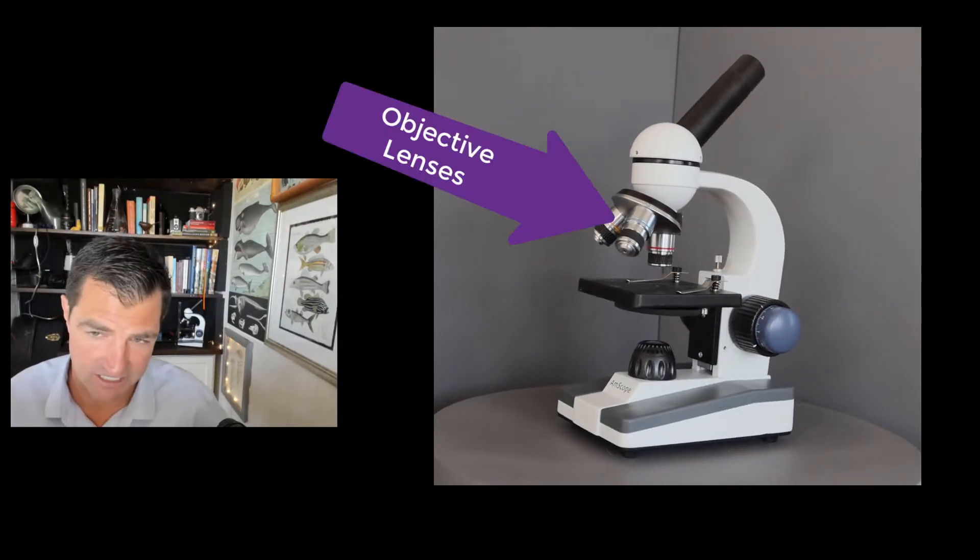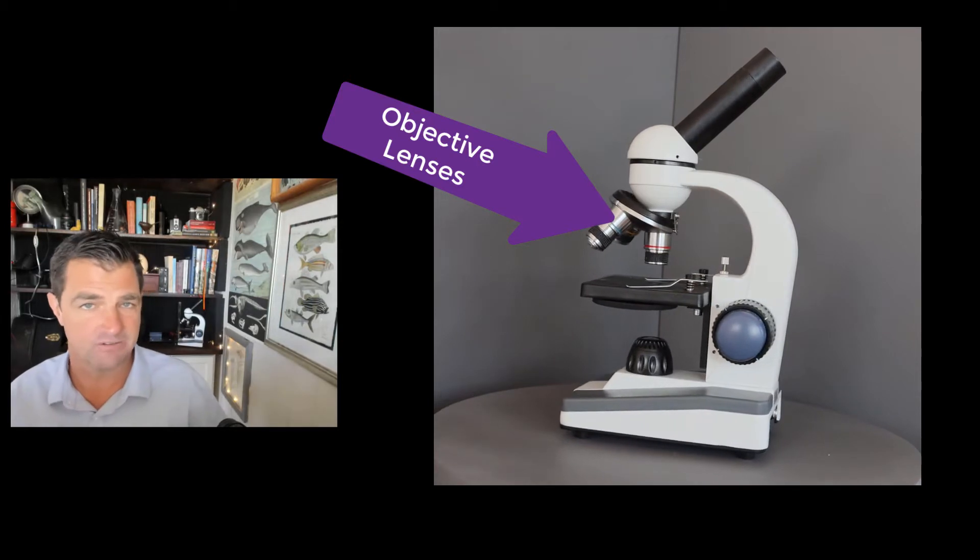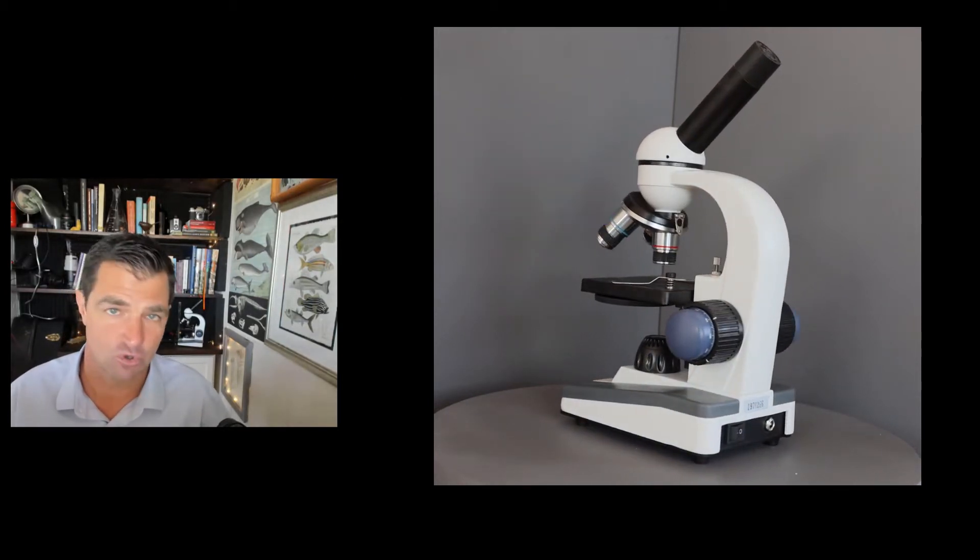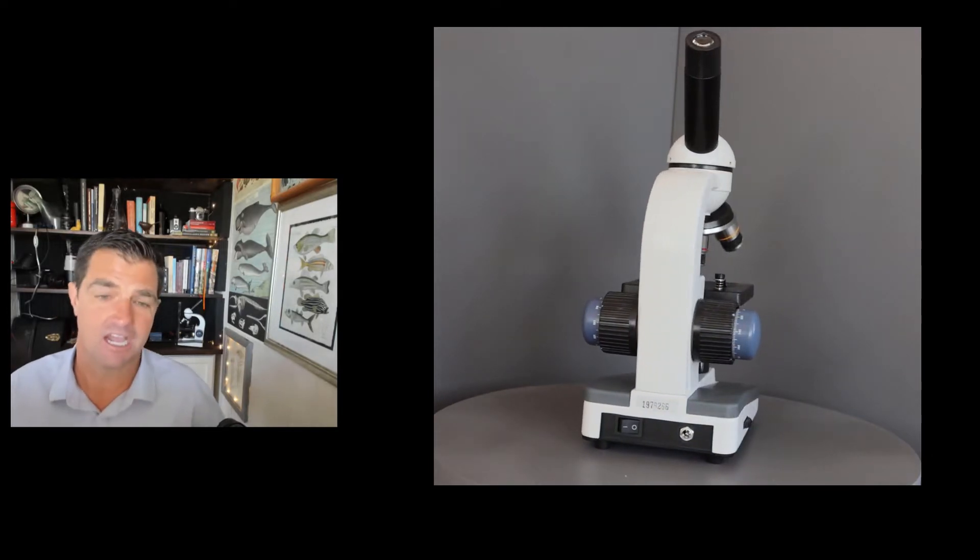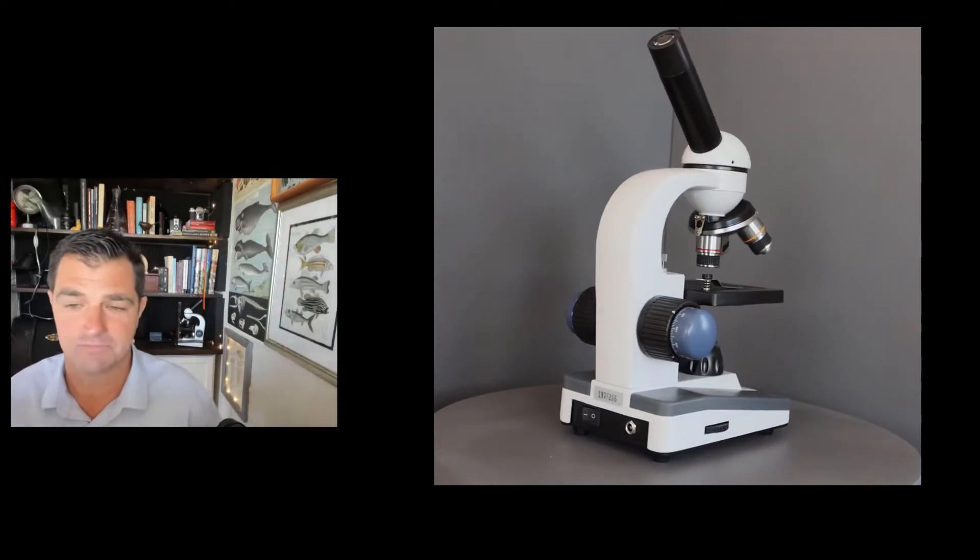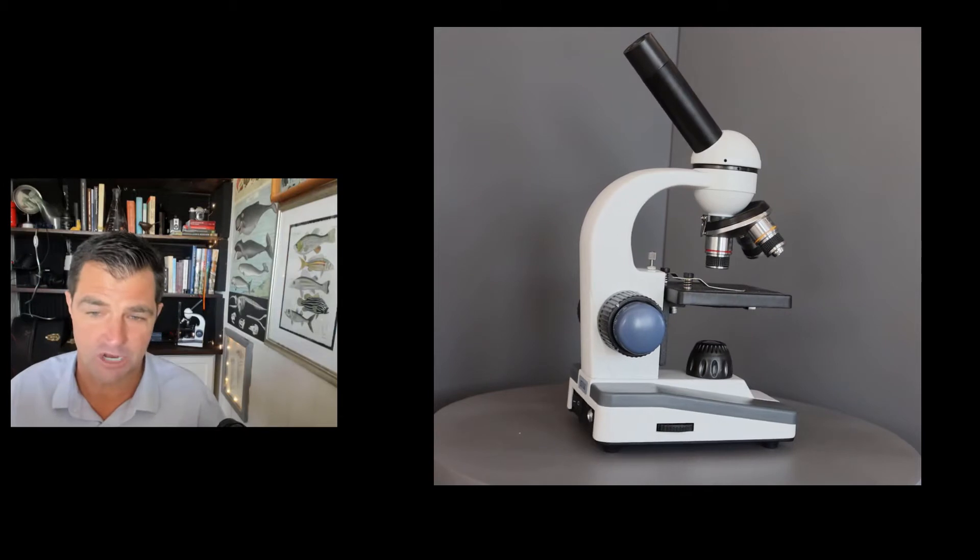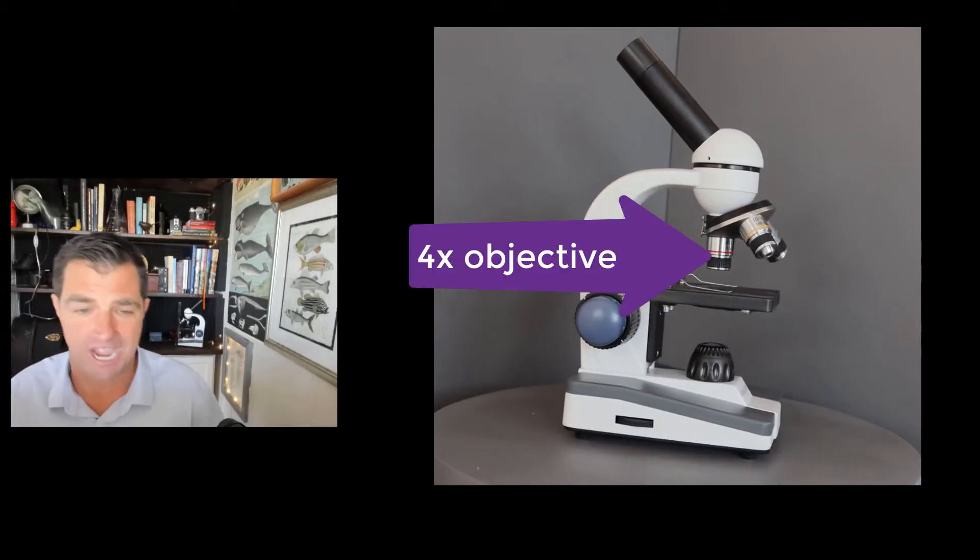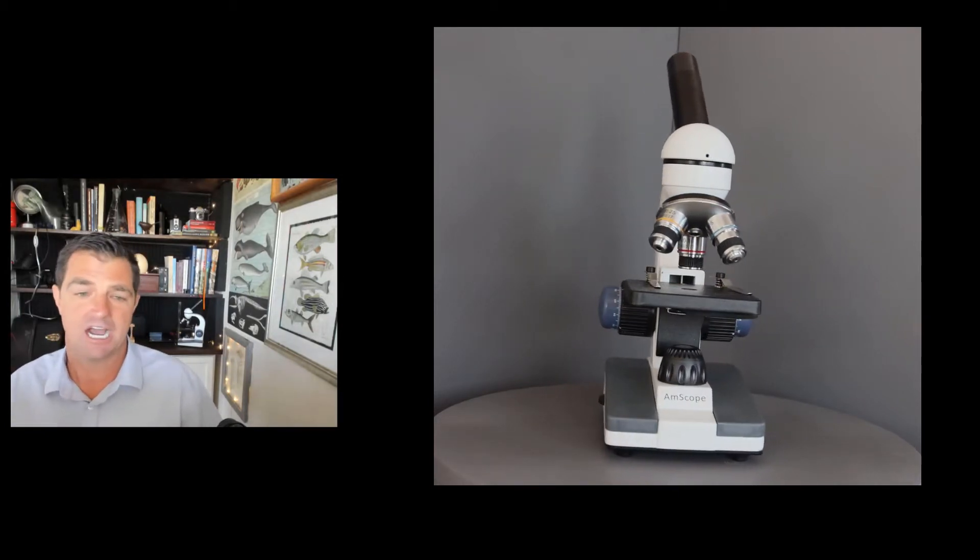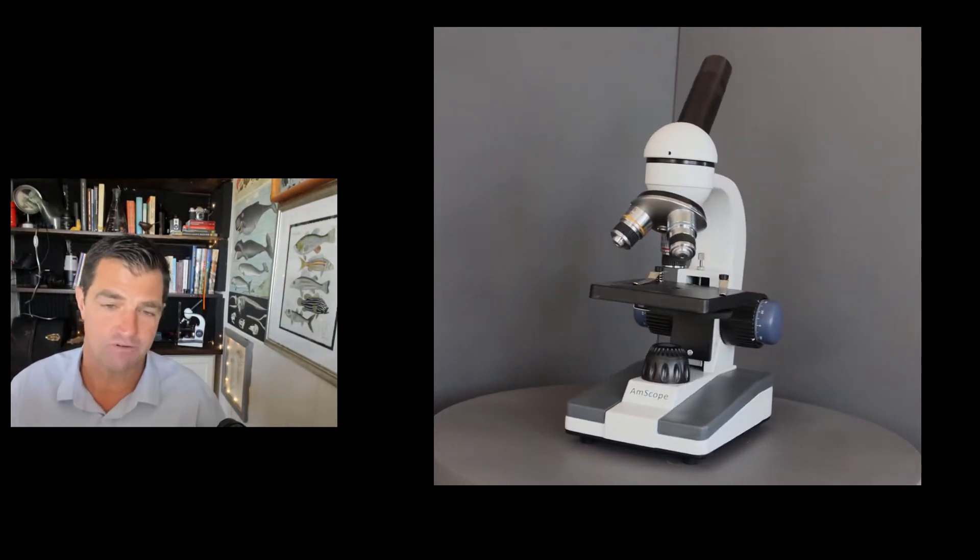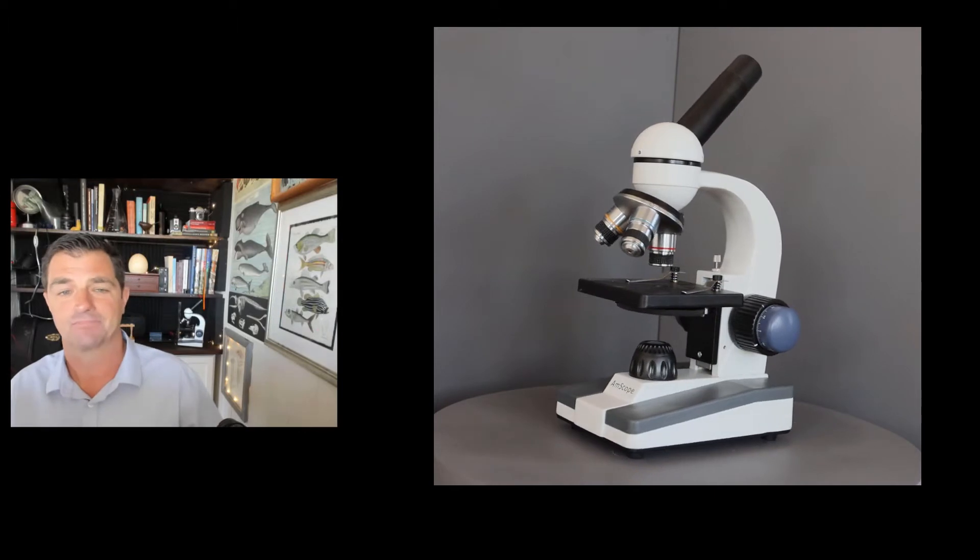Next, we have the objective lenses, and these can be rotated to different levels of magnification. The shortest one, the lowest power setting of these objective lenses, is marked with a red ring around it, and it's a 4x objective. Most of the time, this is the objective lens that you're going to want to start on when you're finding something and focusing it.